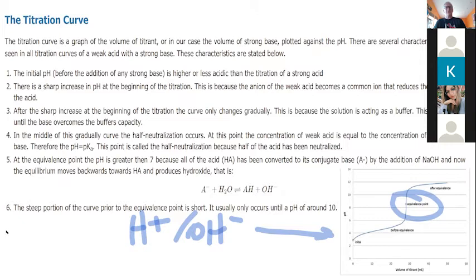It doesn't speed up the reaction. Is it called inductor? Induction? No, it doesn't actually induce anything. I mean, it induces a color change, but in general, we just call it an indicator, right? Because it indicates that your reaction is over.